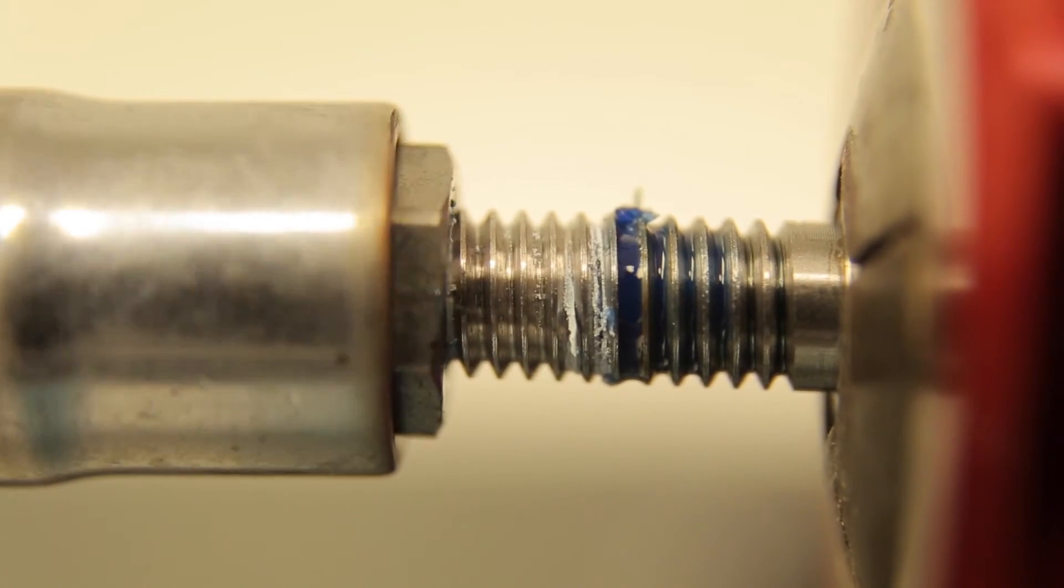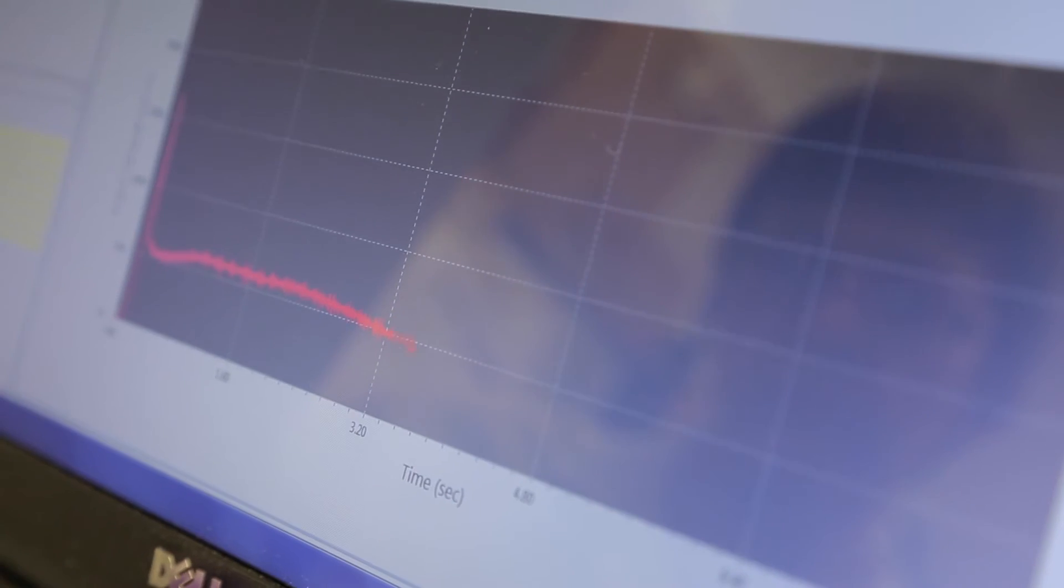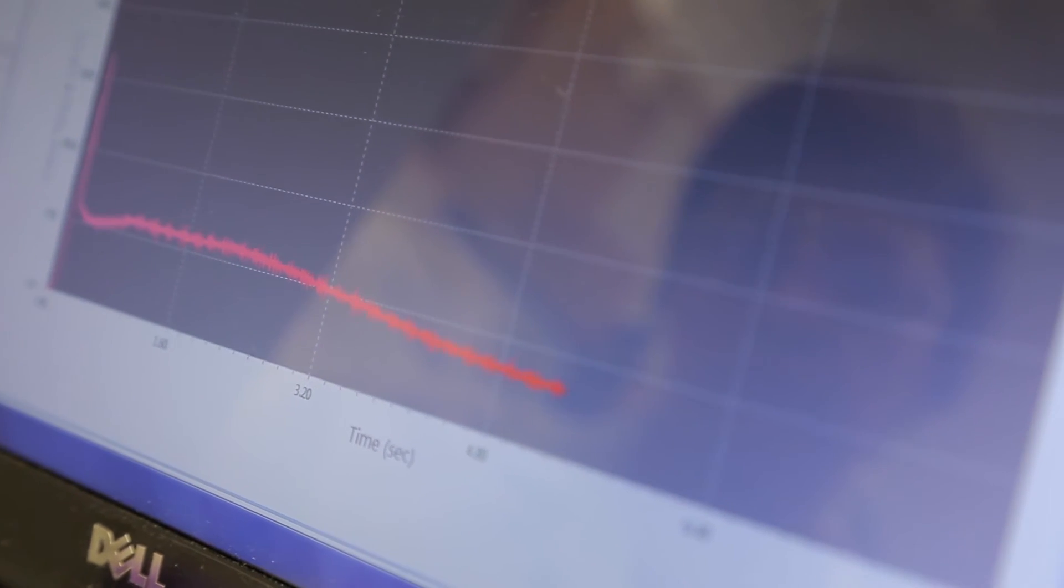This is the breakaway value. We are also interested in the remaining resistance of the assembly, which is measured at 90, 180, 270, and 360 degrees. These results are averaged to obtain the prevailing torque strength, which shows how much friction or drag is left to continue turning the nut.